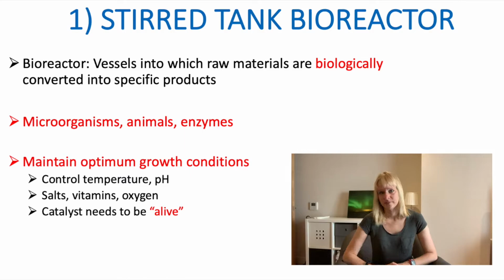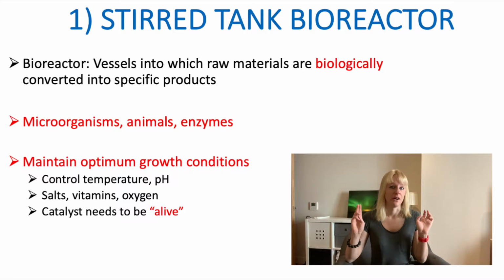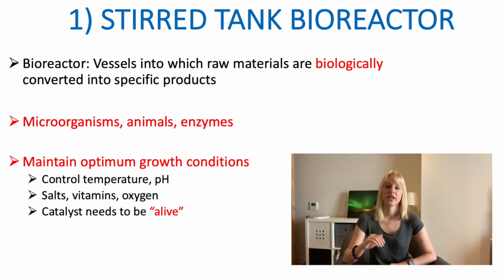Now, the difference if your catalyst is, so to speak, alive, is that you really need to maintain these optimal conditions very well. So the control of the reactor becomes much more important. So we really need to be very strict when it comes to the pH, the temperature, the nutrients, like the sugars and the vitamins that it needs. Because the key difference here is that obviously these microorganisms can die. So if you don't control the conditions well, they easily die off.